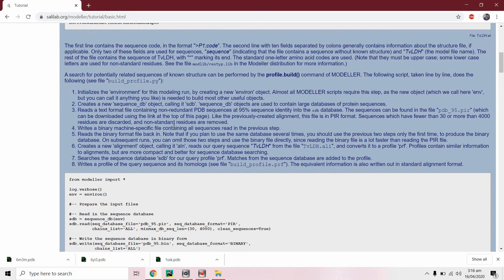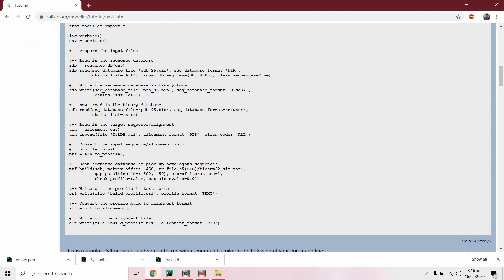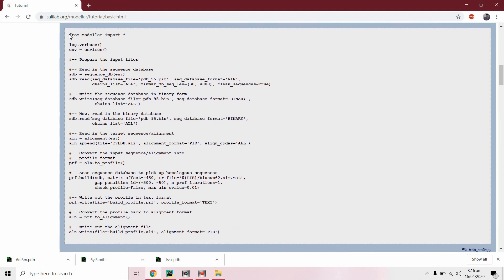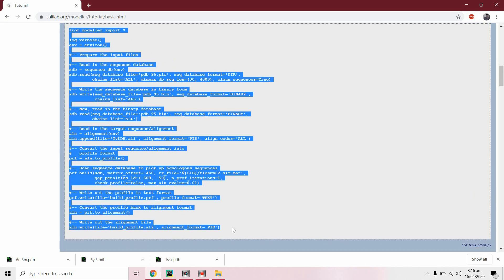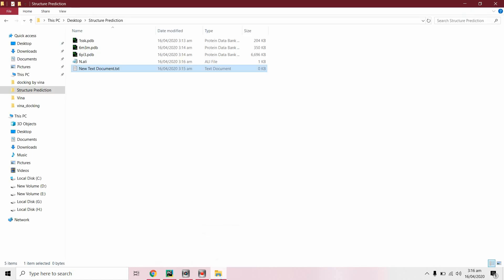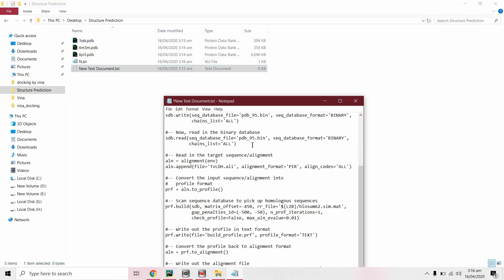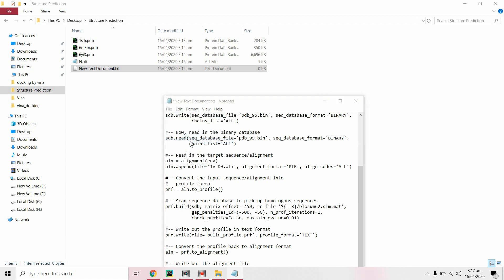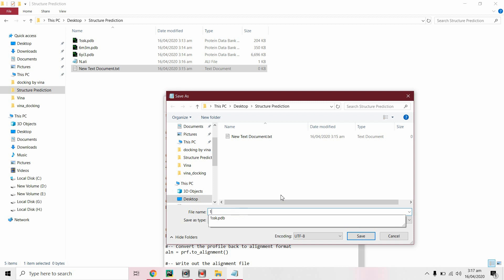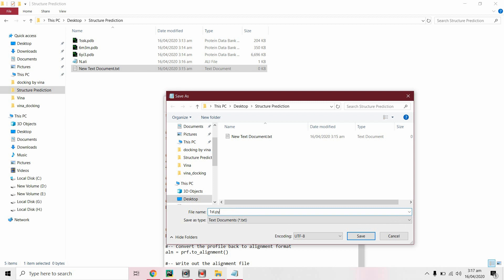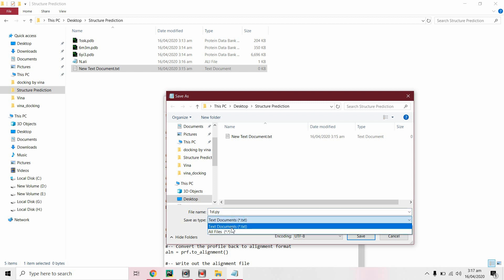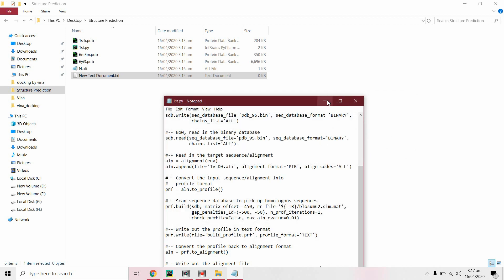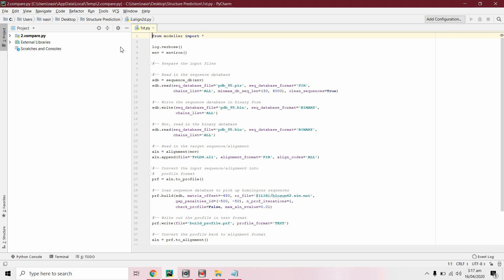For modeling we have to run five scripts. Copy the first script and save it with the .py extension. Now we will edit it. To run the MODELLER script you need the pdb95.pir file.